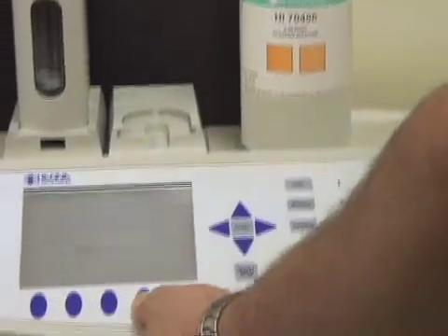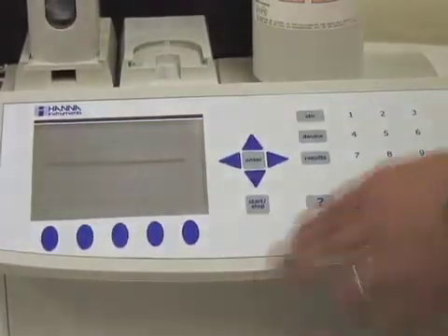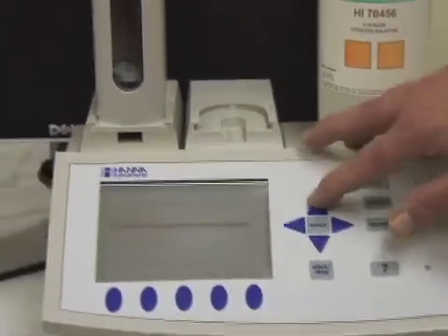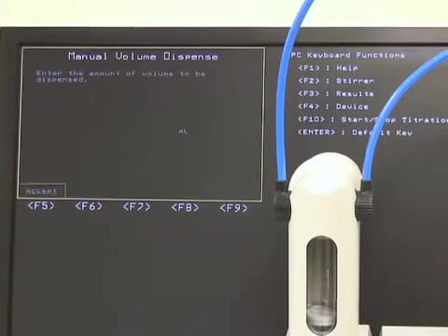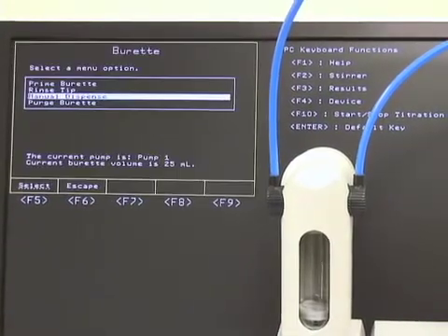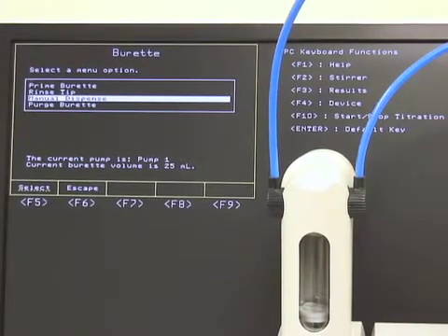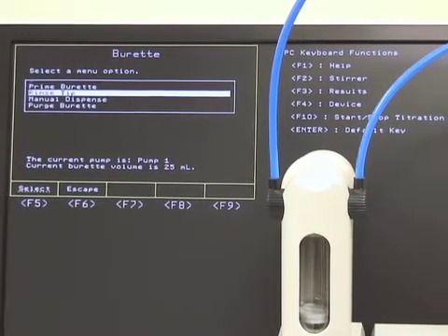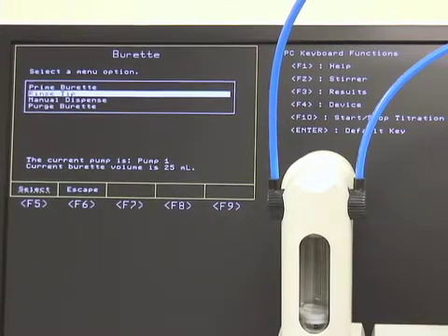We're going to simply click the burette button. Our options in the burette button are: purge burette, which you would do at the end of the day; manual dispense, where you simply type in the amount of titrant you'd like to dispense; and rinse tip, which gives you a small 0.1 milliliter rinse of the tip in case you had any contaminants in there.